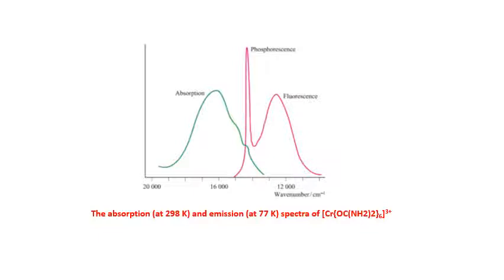When the molecule absorbs the radiation, it goes from S0 to a higher level of the S1 state, and when it decays, the decay energy will always be lesser than the absorption energy. Therefore the wavelength of the emission spectrum will always be red shifted as compared to the absorbed radiation.